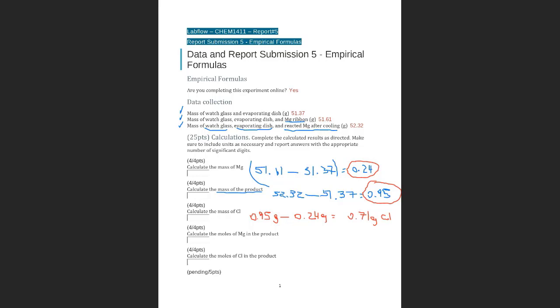Awesome. Okay, now we have the mass of magnesium and we have the mass of chlorine. All I have to do is convert it into moles.